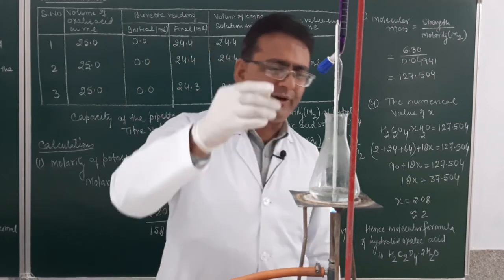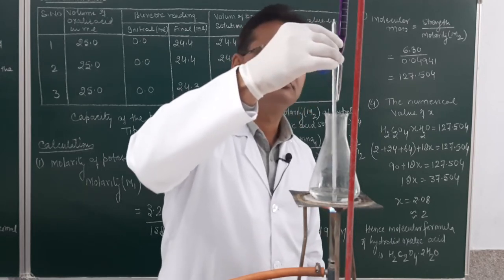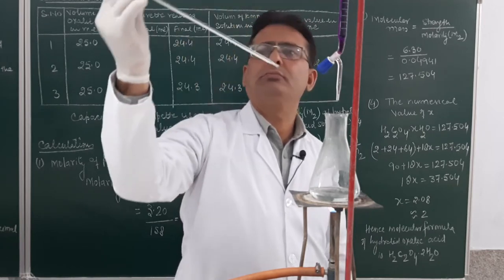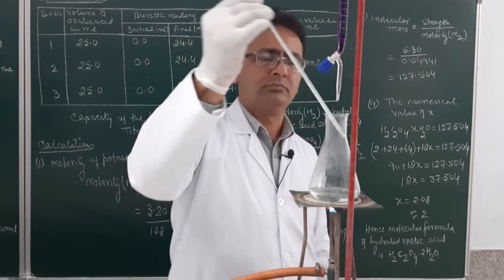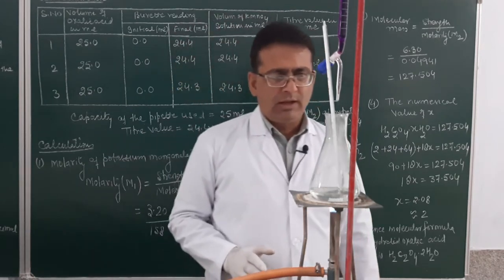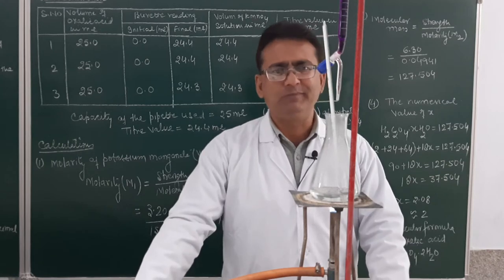Once it gets heated to 60 degrees C, then we will stop heating it. Will heat till the first bubble appears, and that will be approximately the temperature of 60 degrees C.